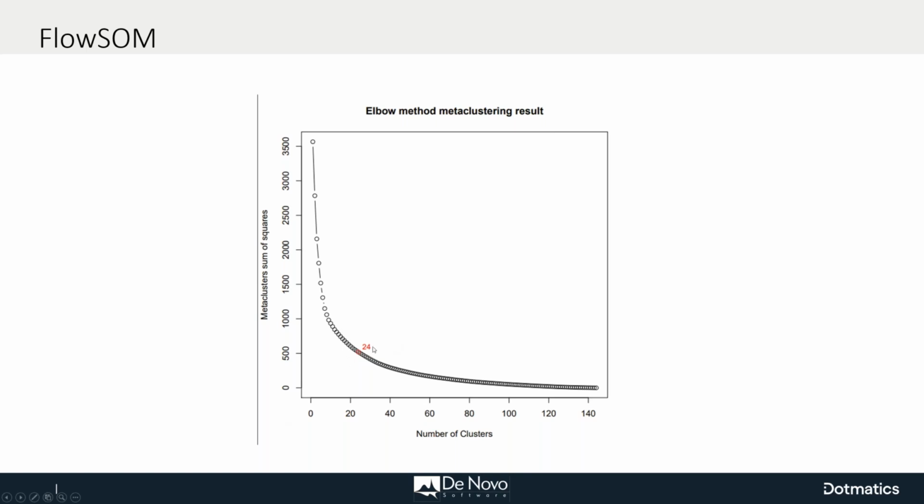It's just taking this totally unbiased, but therefore maybe a little ineffective view of your data and just trying to balance the heterogeneity to the number of clusters. And so if you do use the elbow metaclustering method, I would really make sure to go back and make sure you know what the clusters are and that you can find your smallest population of interest.